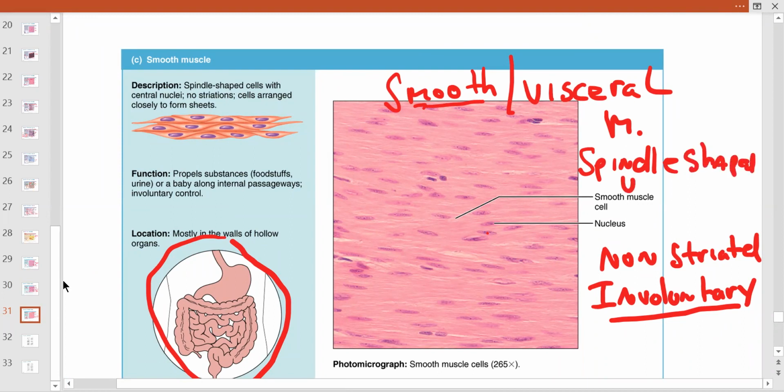It's always uninuclear. Hope I'm clear about the nucleus. That's always that dark staining, DNA containing organelle within the cell. So it's definitely different, muscle versus nerve tissue, very different. But this muscle kind of crosses over, looking like connective tissue. So be careful with this one, please.